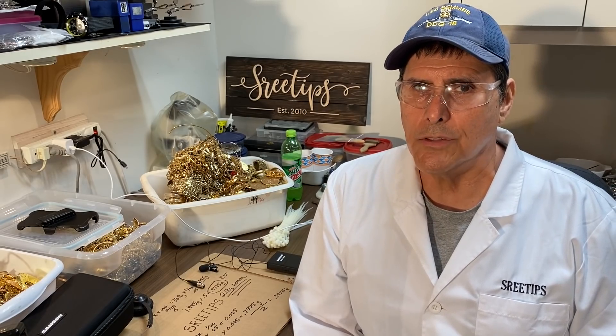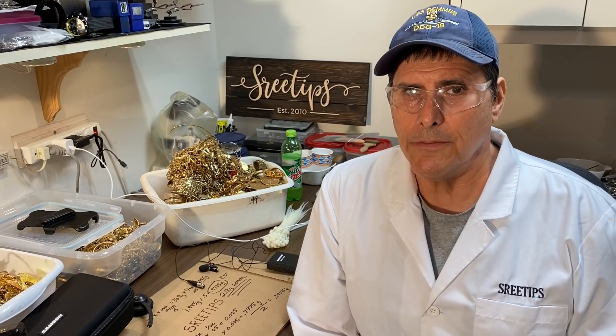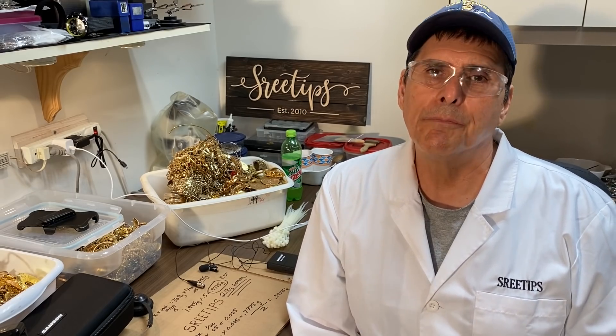Danger. I'll be handling corrosive acids and doing reactions that produce deadly fumes in this video. Doing these reactions without proper safety equipment could cause serious injury or death.